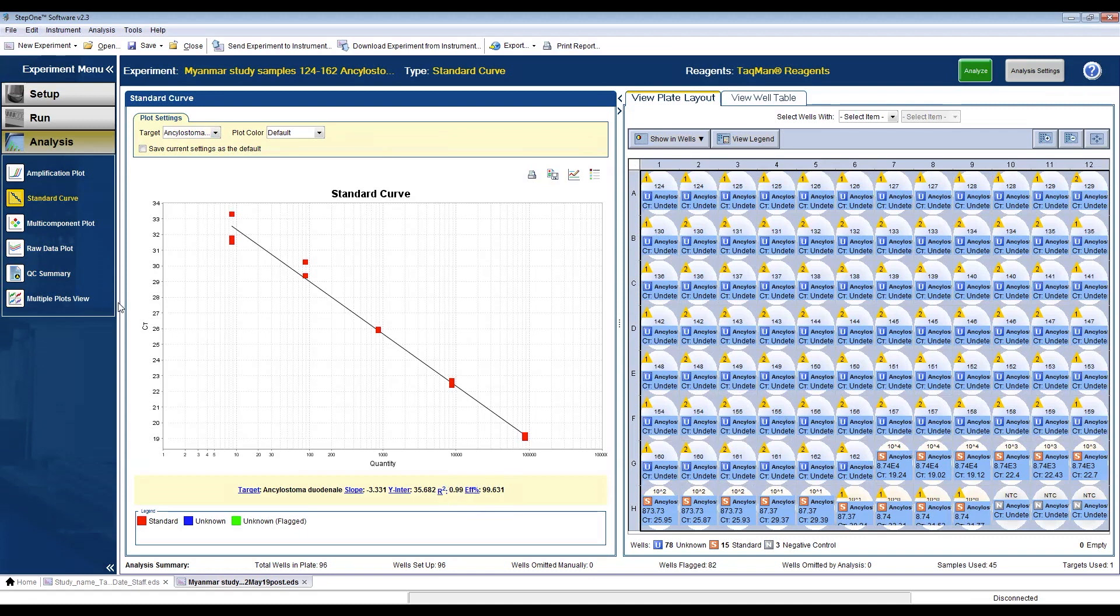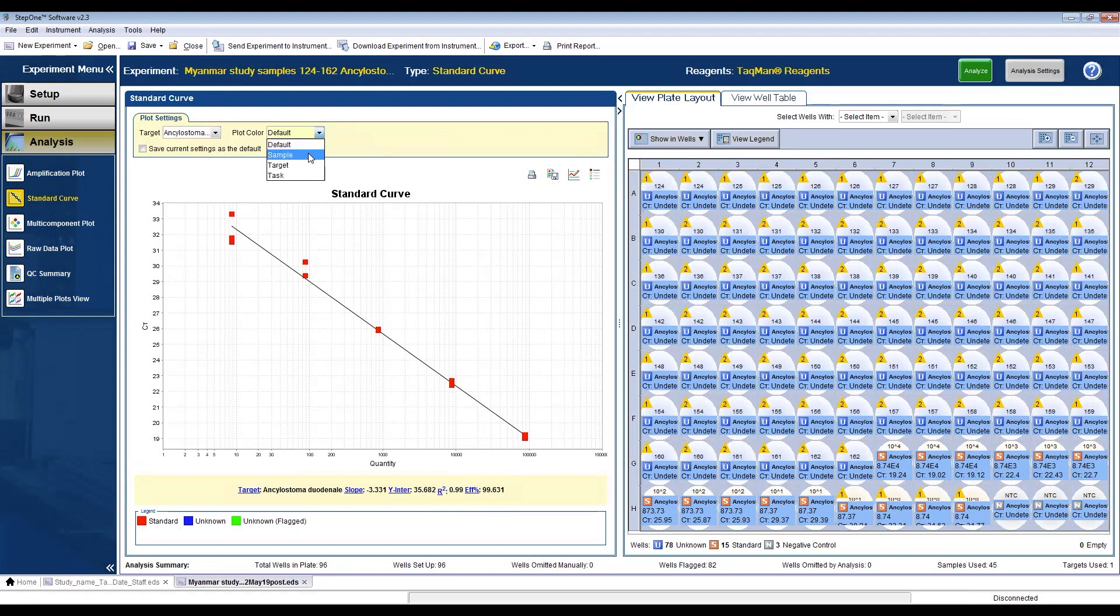If you change the plot color by sample, then you can see if the quantitation for the samples that test positive for that target fall within the range of the curve, hence the quantitation is more accurate. Any samples falling outside of the standard curve in either end should be retested.